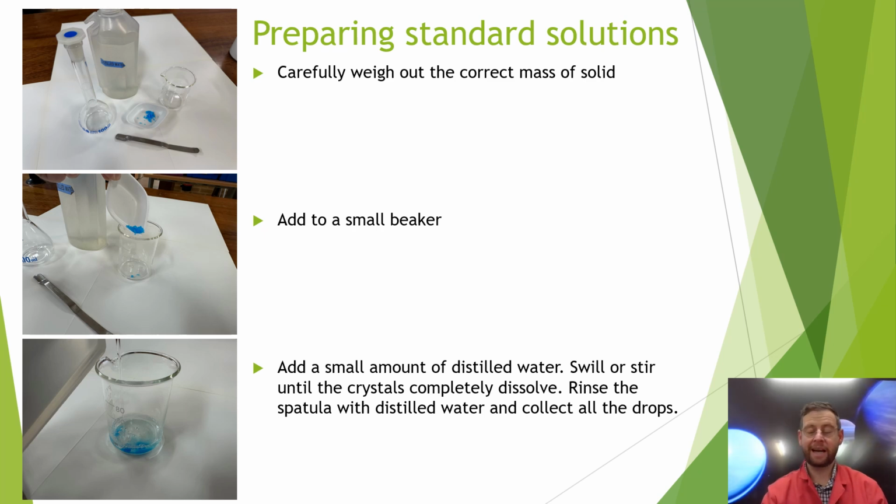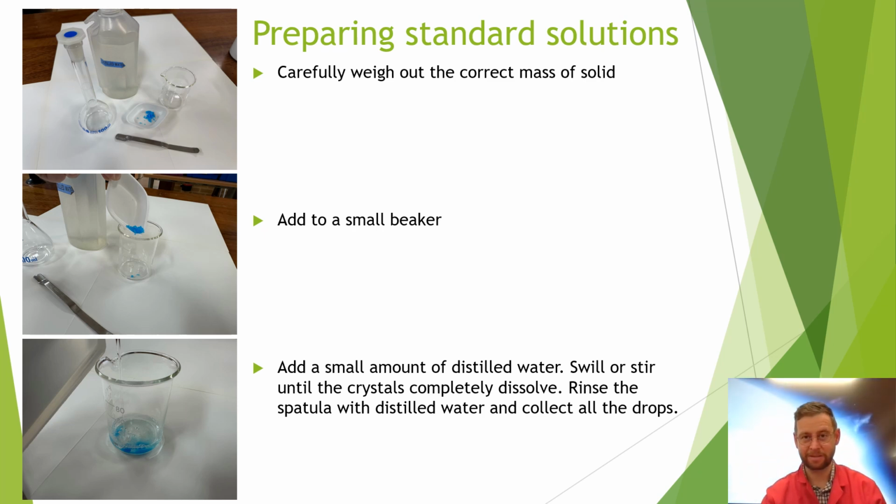But then eventually, when it has all dissolved, you need to rinse off any substance that's stuck to the spatula. So give the spatula a clean with the distilled water, with all of the drops going back into the solution, so that you have caught every last drop of that substance.